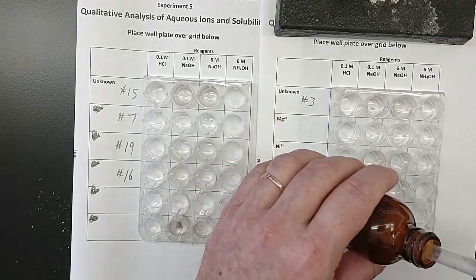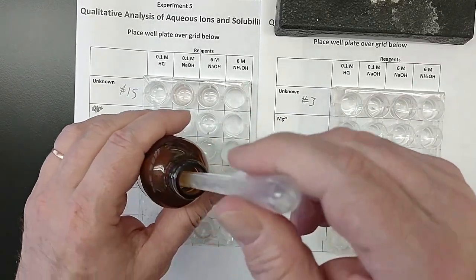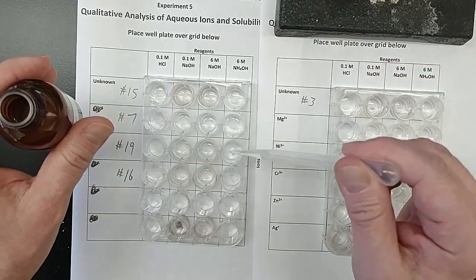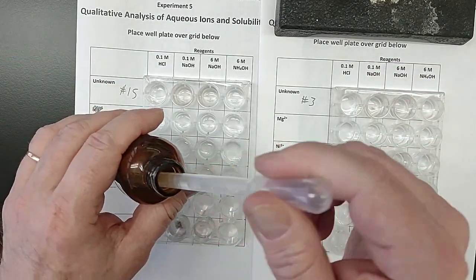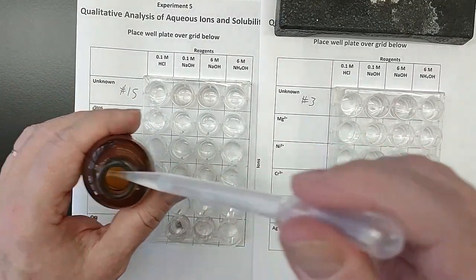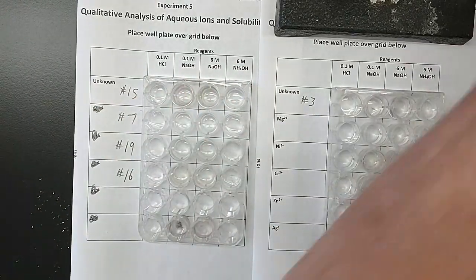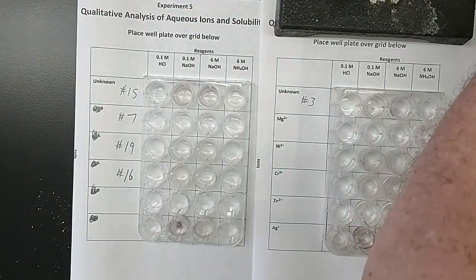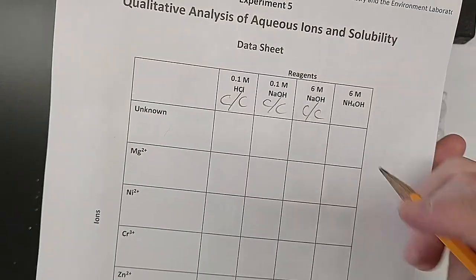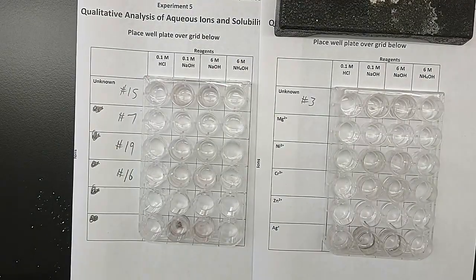And so this is rather potent smelling, but I am just not getting it near my face. Notice also clear and colorless, just like the others. So in pen, I record clear and colorless for the ammonium hydroxide.